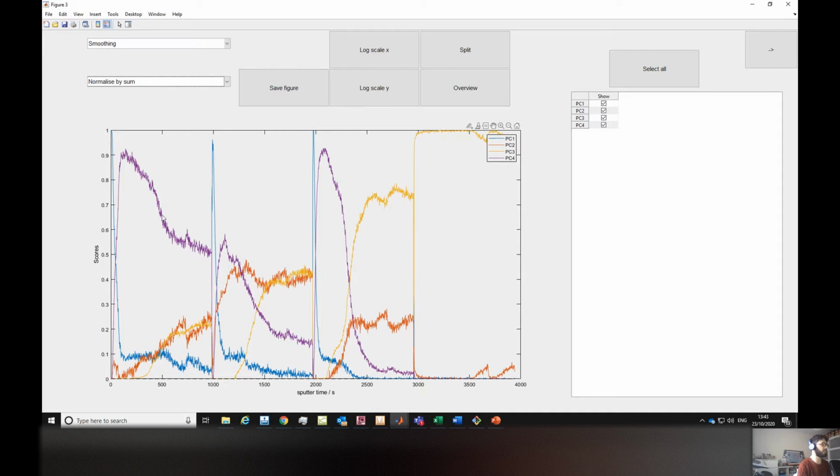But in this case, you can see all the peaks across all parts. The blue stuff, you can see it's covering basically the worm because it drops very quickly, and then you have this inside part. And I think the most interesting is in the second one, which I think was the bottom part. This red signal is much more intense.